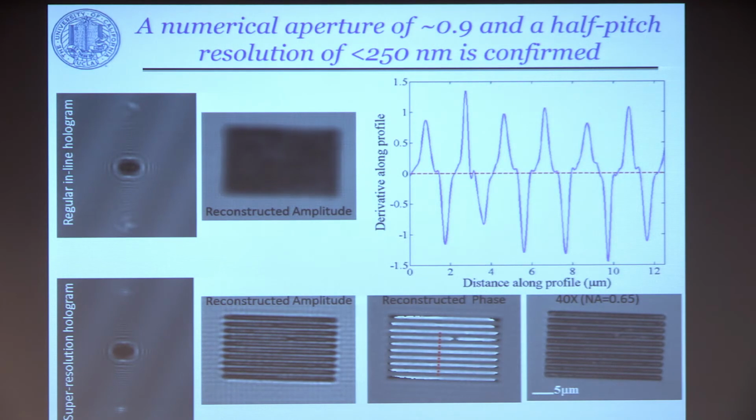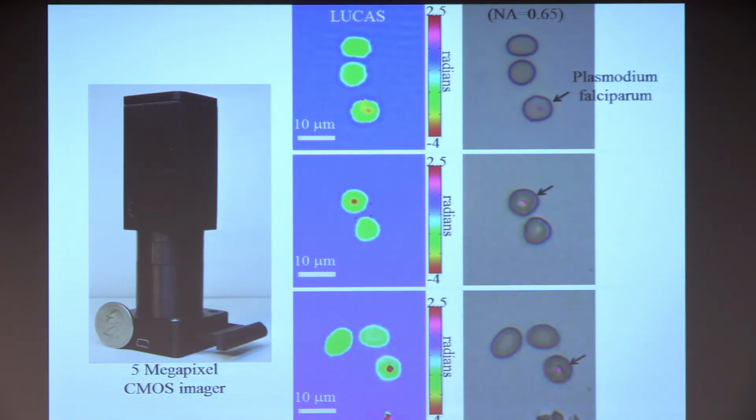It's the same thing that we do now computationally to push the resolution of this system to the diffraction limit. So using a field portable system that has this kind of technology, everything is computational and the hardware is still very inexpensive and simple to put together. In fact, this prototype that you see here, also 3D printed, has been put together by essentially an undergraduate researcher. So it's at that level where even relatively poorly trained students could put them together.